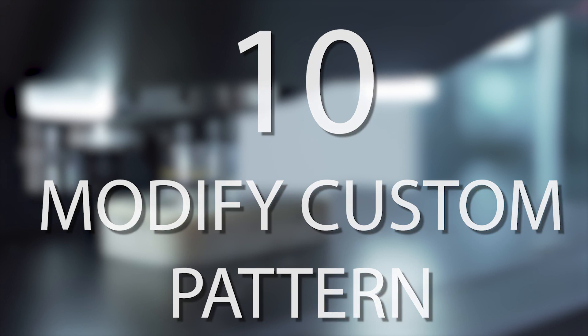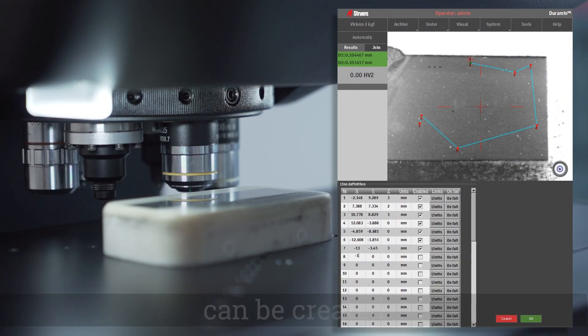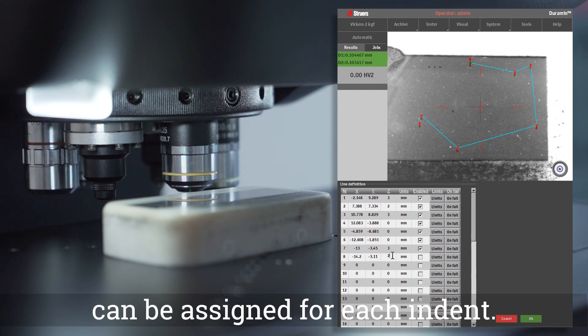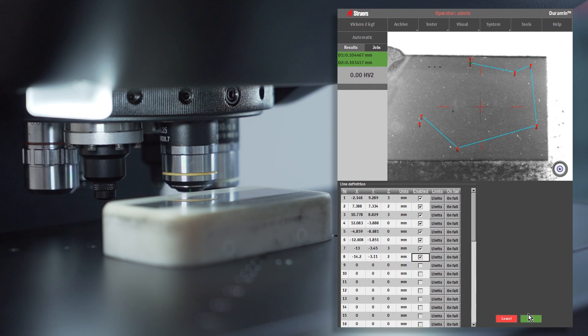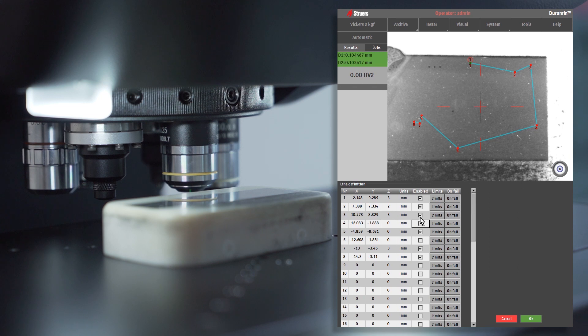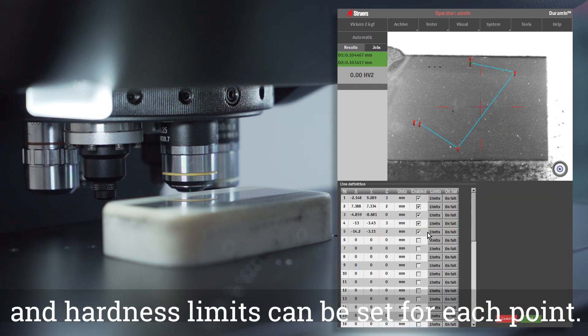Modify Custom Pattern. A completely customized pattern can be created, where X, Y, and Z coordinates can be assigned for each indent. Points can be activated or disactivated, and hardness limits can be set for each point.